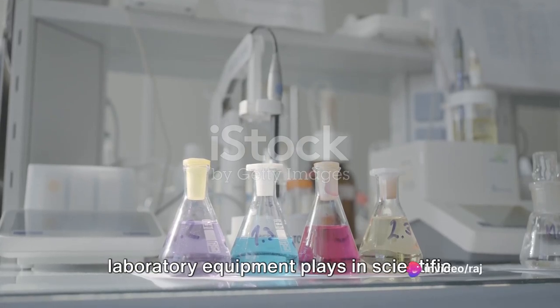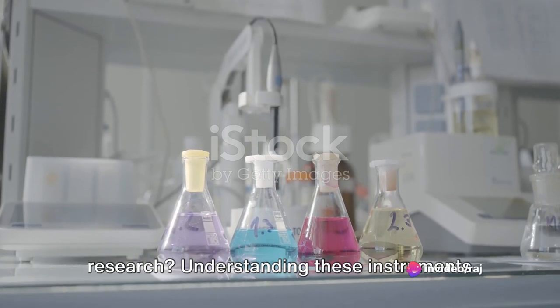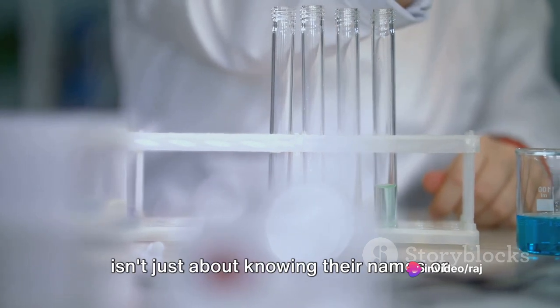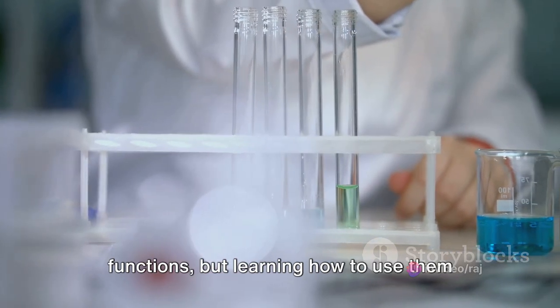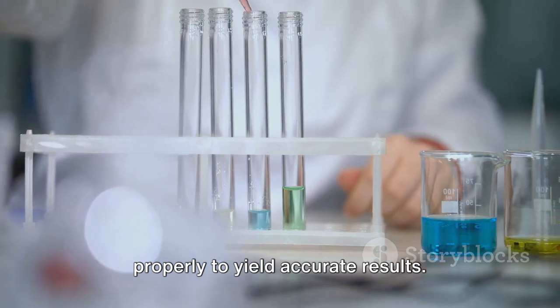Ever pondered the critical role that laboratory equipment plays in scientific research? Understanding these instruments isn't just about knowing their names or functions, but learning how to use them properly to yield accurate results.